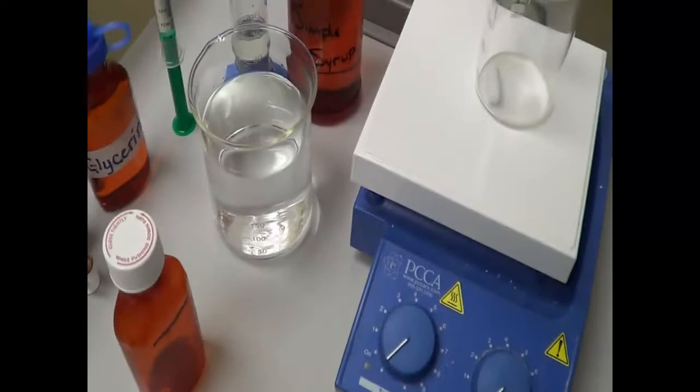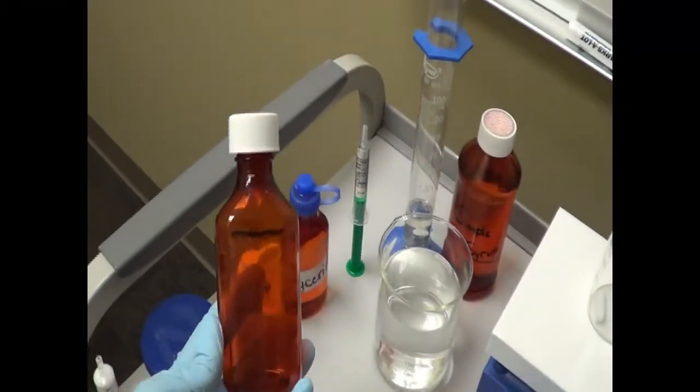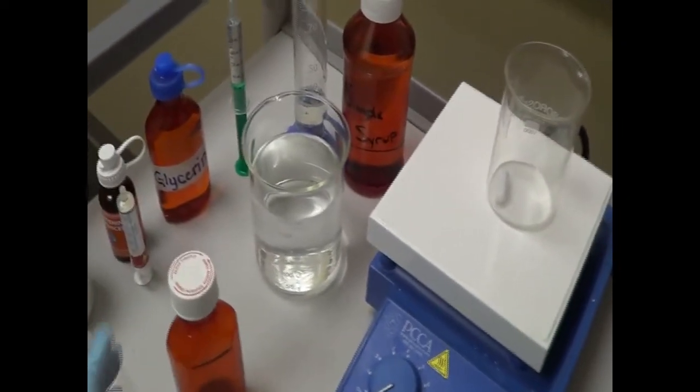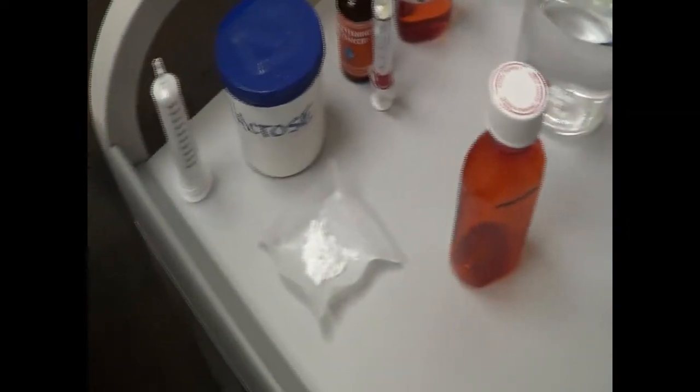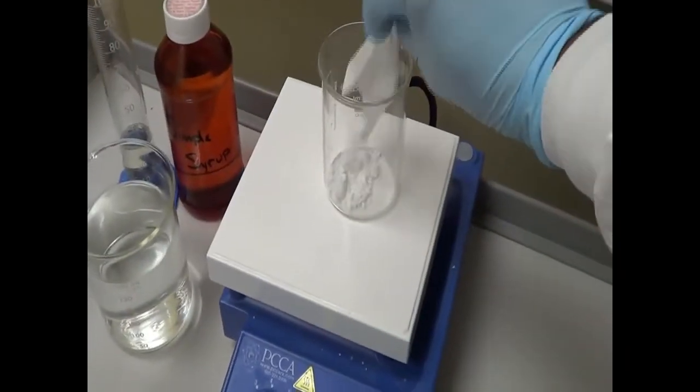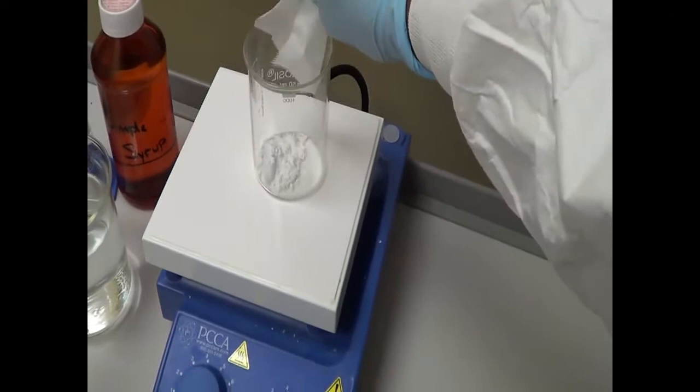We have some water here, and I pre-calibrated the bottle. The first step is the calibration. Once you are done with the calibration, we are going to place the lactose in the beaker — it is a 150 ml beaker.